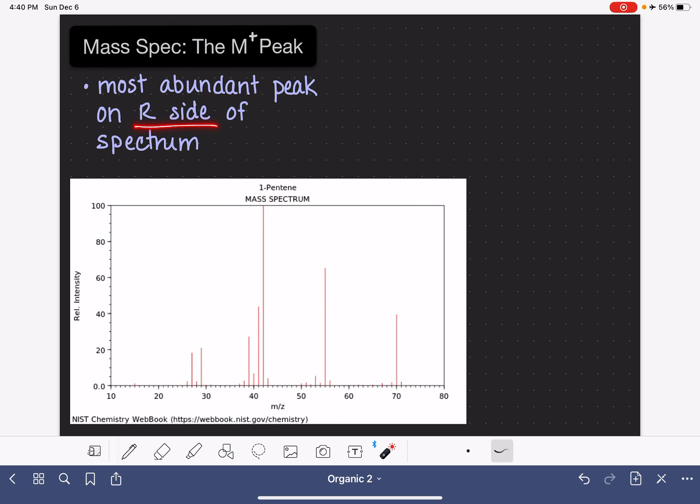It is the most abundant peak on the right hand side of the spectrum. When we go all the way over here to the right hand side on our horizontal axis, the most abundant peak on the right hand side is this little guy right here. We are not looking for the most abundant peak overall, and we're also not looking for the furthest right peak, that teeny tiny little one.